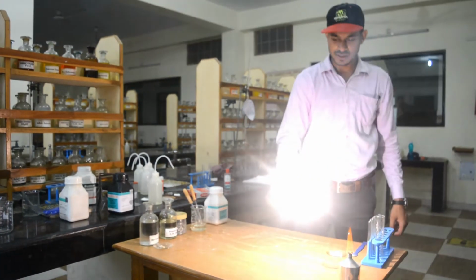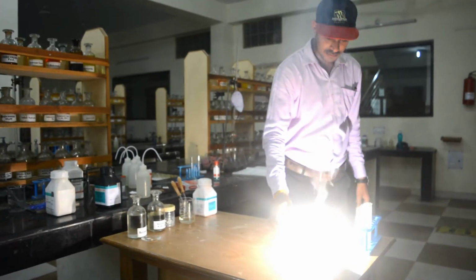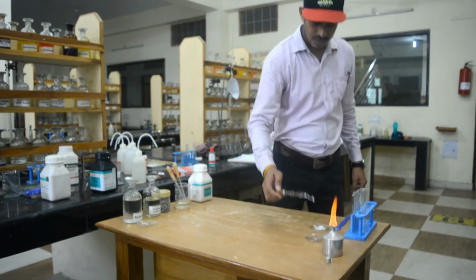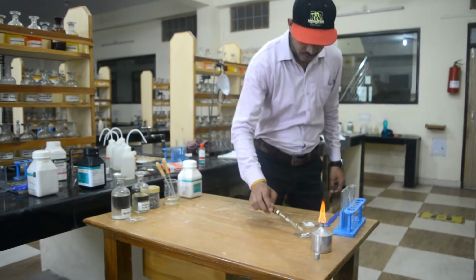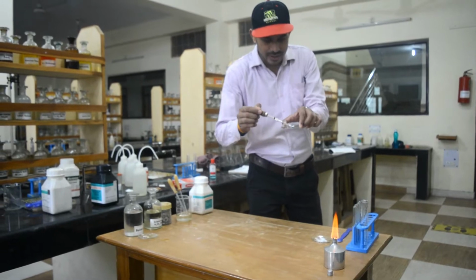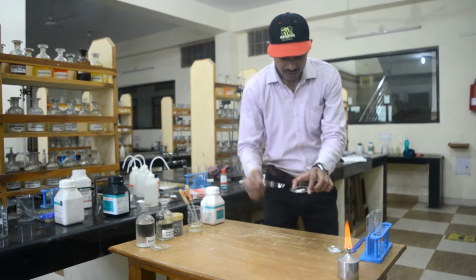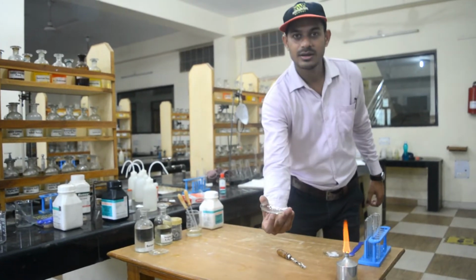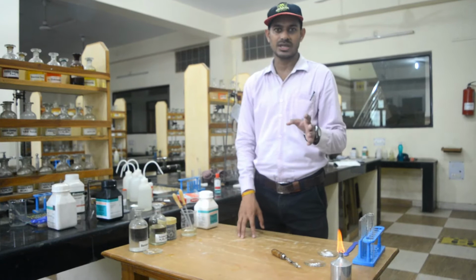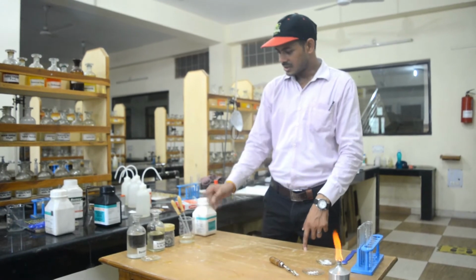So you can see that it is burning. A white substance, a white ash, has been formed here. This is the magnesium oxide which has been formed. This is showing the combination reaction where magnesium is burning in the presence of oxygen and forming magnesium oxide.